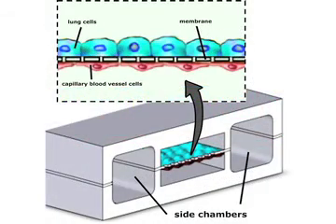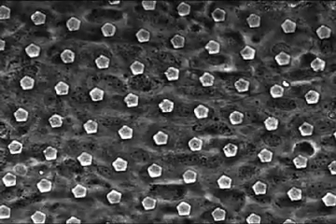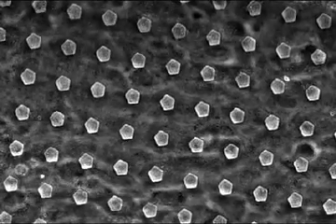And so we recreated this using microengineering techniques by making small channels in this flexible material that are lined by airway cells, capillary blood vessel cells, and they share a common membrane that's flexible and porous. And we're able to apply suction into neighboring channels that makes us stretch and release, and it literally mimics what the lung cells experience when we breathe.